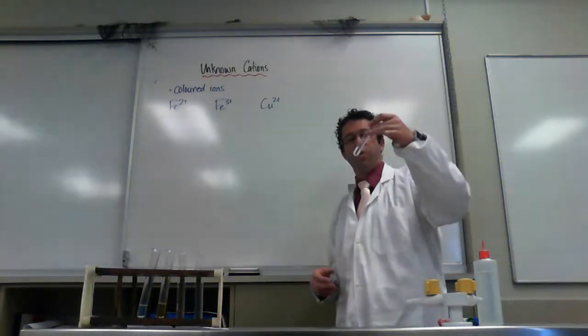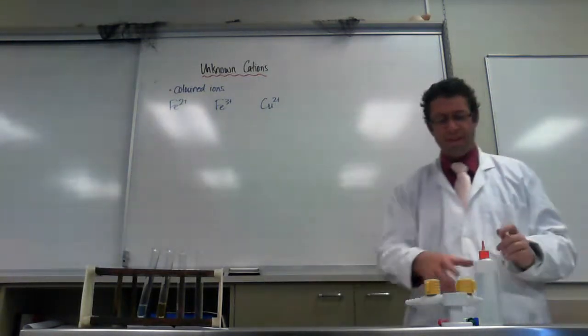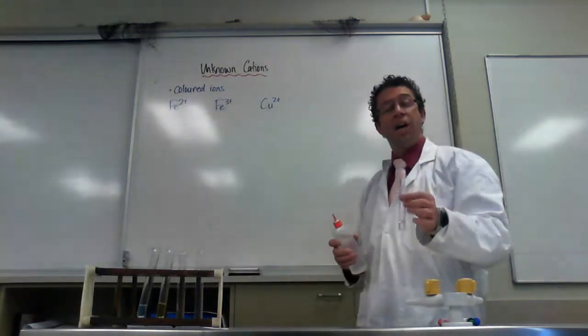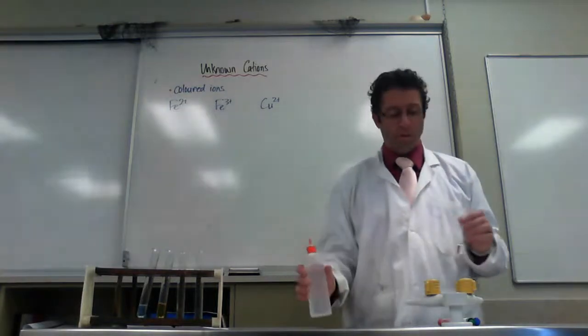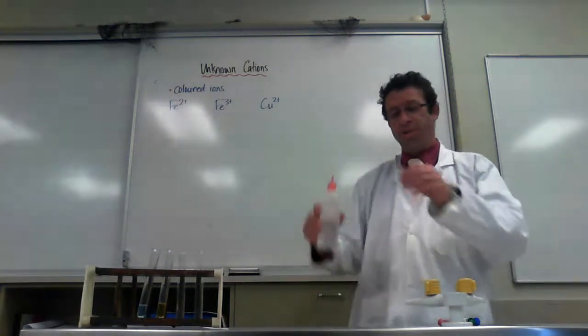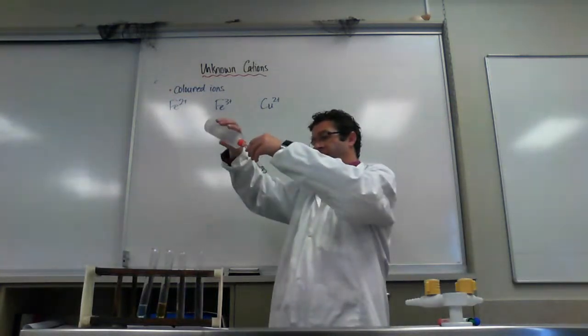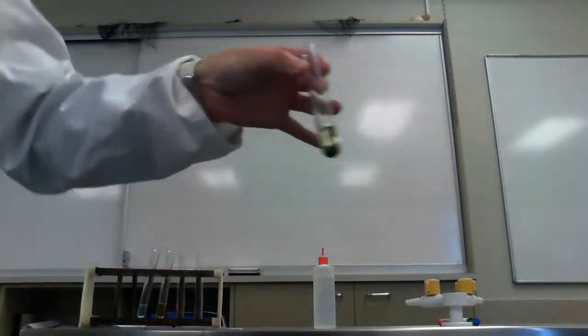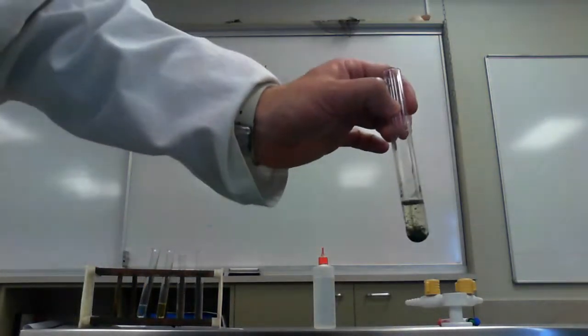So after you see the color of it, you would think that's Iron 2+ because it's a pale green color. How do we confirm it? Well, the most useful chemical for us here is going to be sodium hydroxide. And with that we see that we get a green precipitate there.